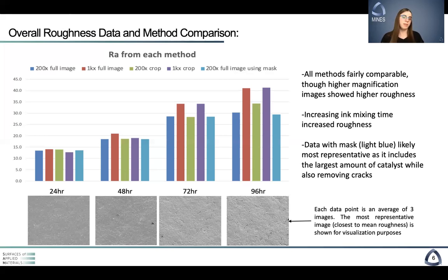This might just be because they were looking at a smaller area and thus zoomed in more. It's also possible that the way the algorithm was counting roughness, a big bump or crack that's 5 times larger is going to look rougher than in the lower magnification image, even though it's the same crack.